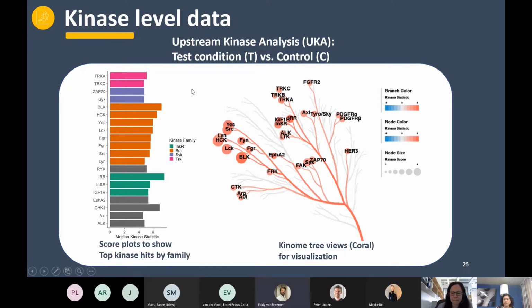Yes. So you're asking about this coral tree, the colorful tree, Astrid, if I'm right? Right. So that comes from the data that you download. We have a way where we can automatically plot this by bringing it into an RStudio format, or go directly in the website.